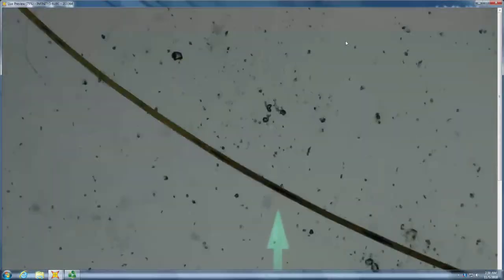Okay, what have you got here? So first off, did this fall out or was that cut? That was cut. How about the other end? No, it was cut too, okay. So that means the hair wasn't falling out. We just cut a sample of it, because it's cut on both ends. So this is probably not hair falling out or hair fragility, because it was cut at both ends. And then you look in the middle and what are you seeing?